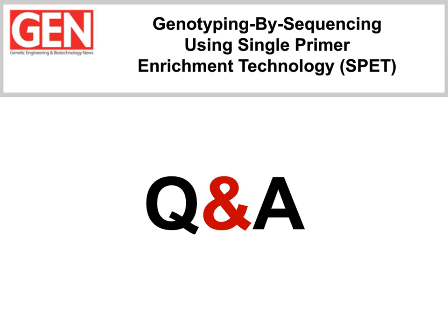However, I would say that without the forward read, users can keep the deduplication capability using only the 6 random bases, and in some cases this can be very cost effective in a very targeted genotyping experiment like ours, without paying the money for the forward read.